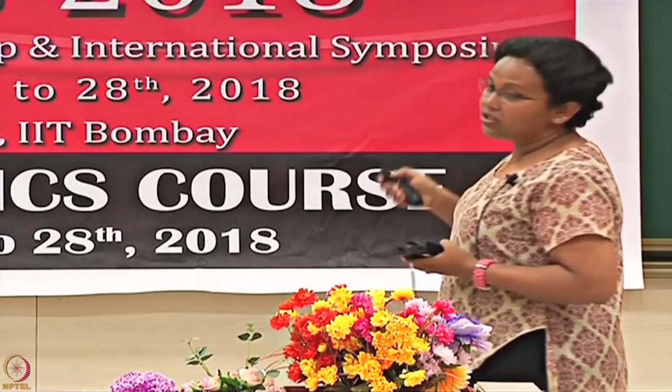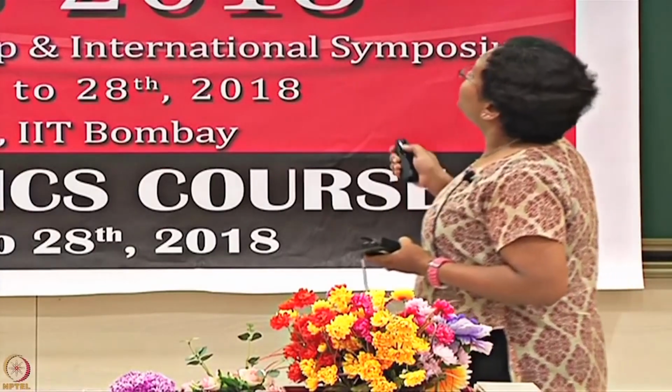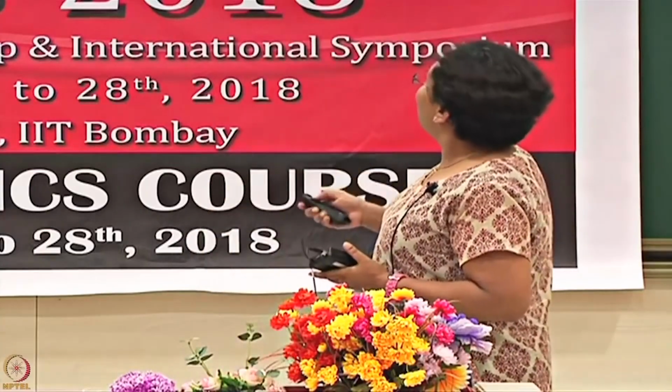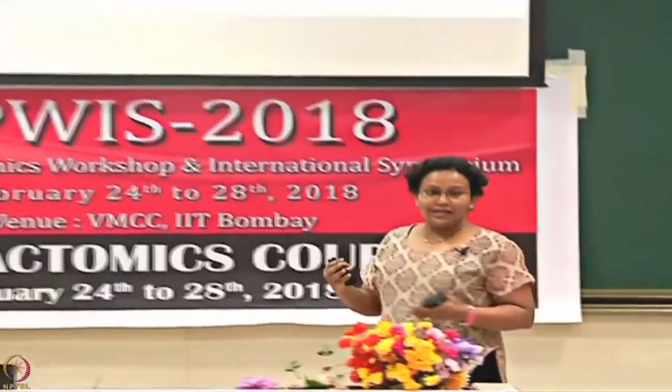When you put this mixture on your surface where your ligands are bound, you see the binding only because of your competing analyte, okay. When these analytes are so small and negligible, you do not get to see your binding. So, here too, with increasing concentrations of your analyte, you see less and less binding.